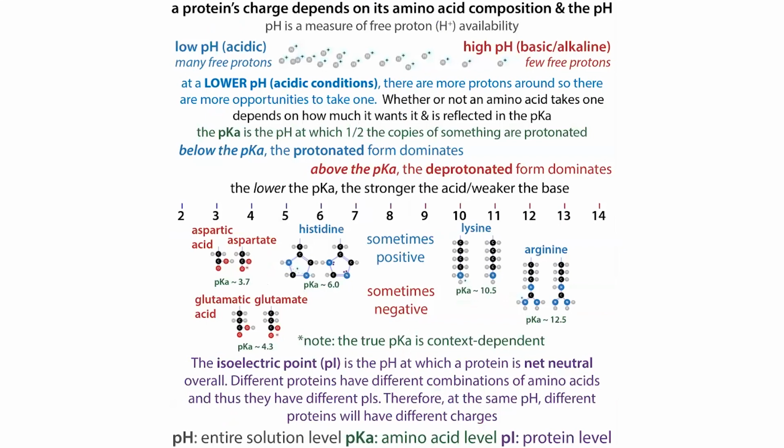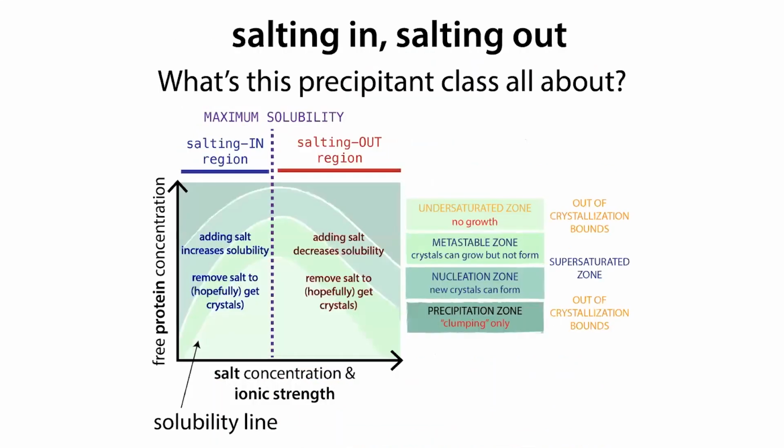So some parts of protein, some of the amino acids have charges. Most of them don't, or at least not full charges, but there are some that can be positively charged and some that can be negatively charged. And these ones especially are going to be influenced by those salts. The salts can kind of form a binding pair where you have a positive and a negative. And if the protein can't get that from the salts, then it's going to try to get that from another protein molecule or from another part of itself, and then cause the protein to misfold, which again makes it more prone to aggregation, or binding to another protein, which will make it aggregate. And so if there's not enough salt, then that can happen.